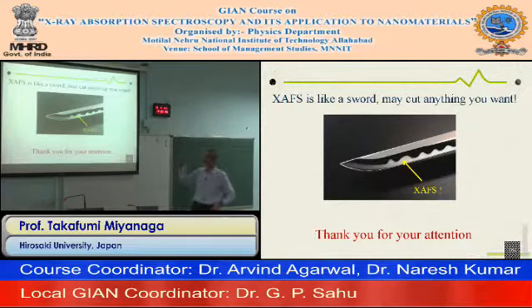My image is this: Japanese samurai soldiers. One EXAFS facility can cut magnetic systems, semiconducting systems, nanomaterial systems, and biological systems. Everything, we can try to get local structure information. So that is my image.